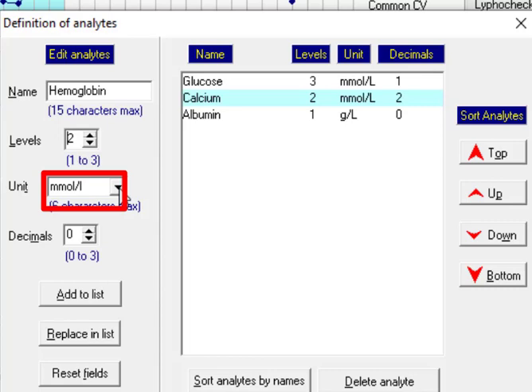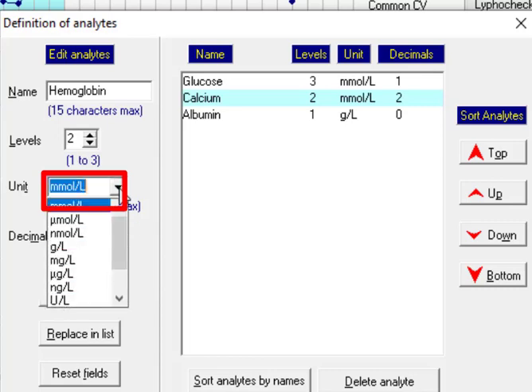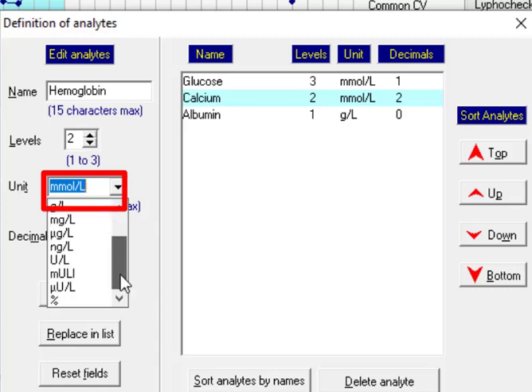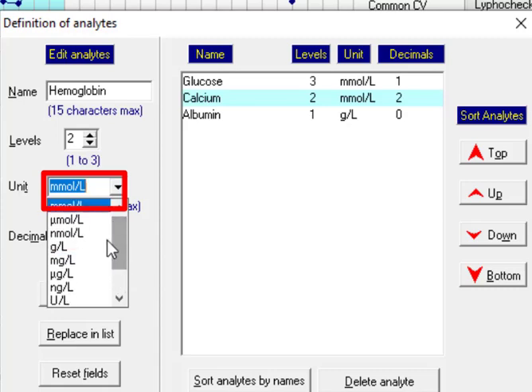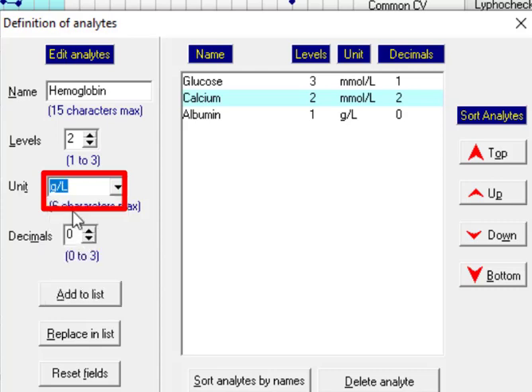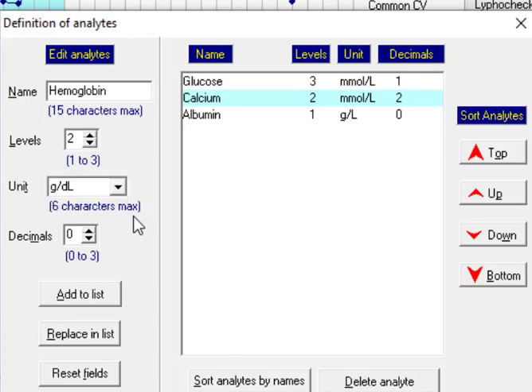This field is for specifying a unit for the analyte. Hemoglobin is based on gram per deciliter. From drop-down list we choose gram per deciliter but we do not have gram per deciliter so we choose gram per liter and add a D before the L letter.